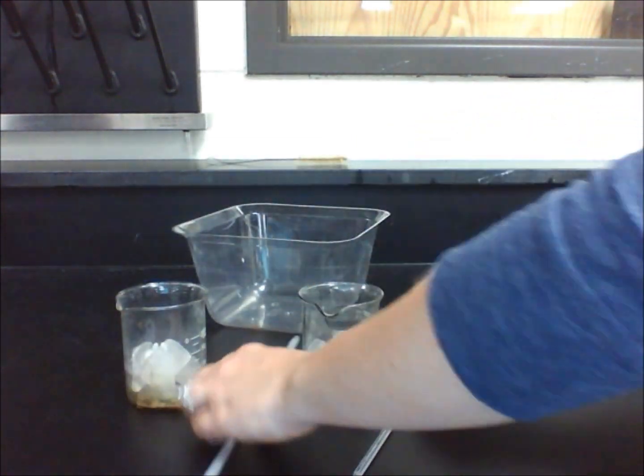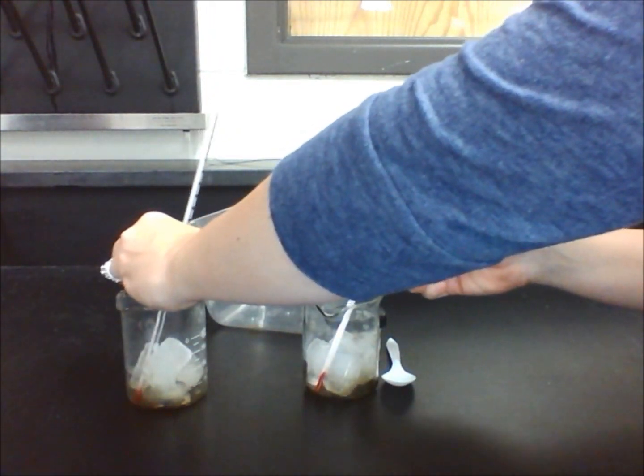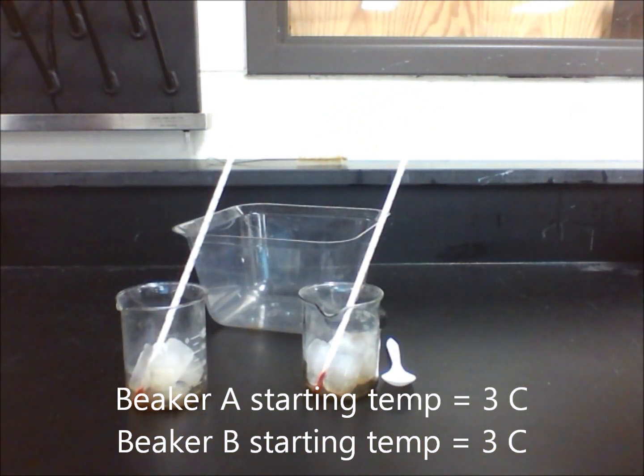Place a thermometer in each beaker and wait one minute. Measure the temperature of the crushed ice from each beaker and record your results in table 1 for starting temperature.